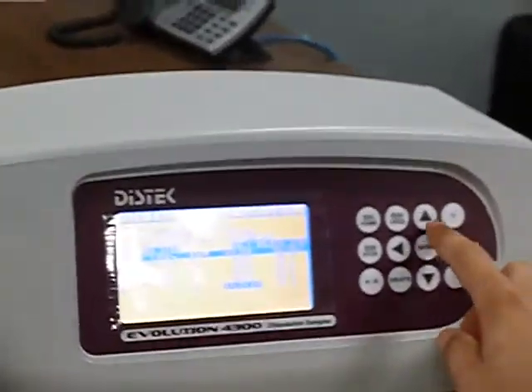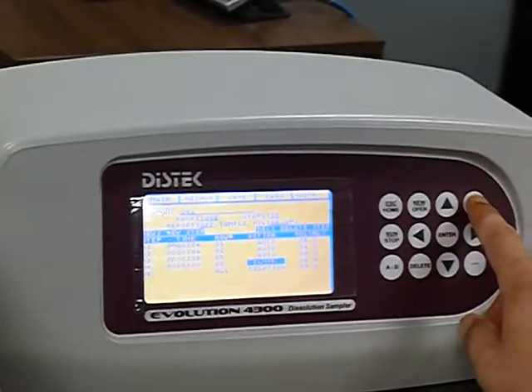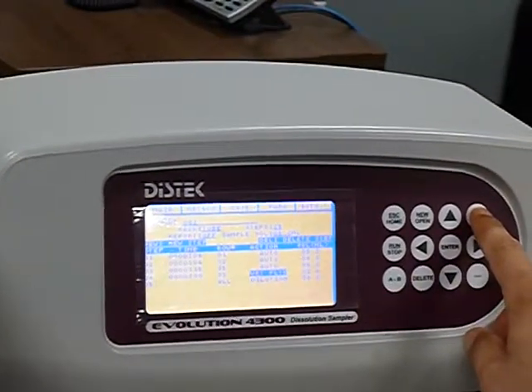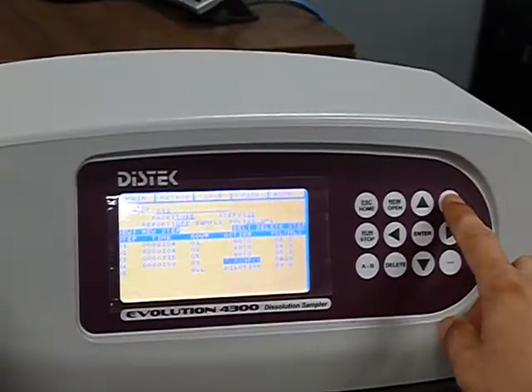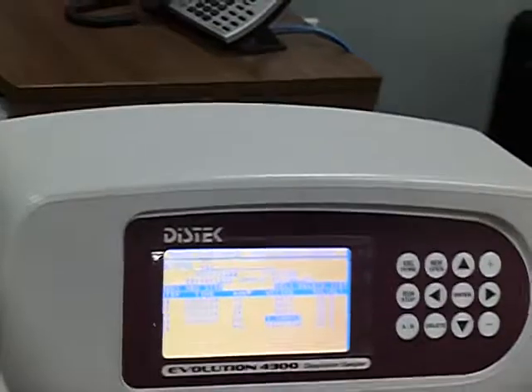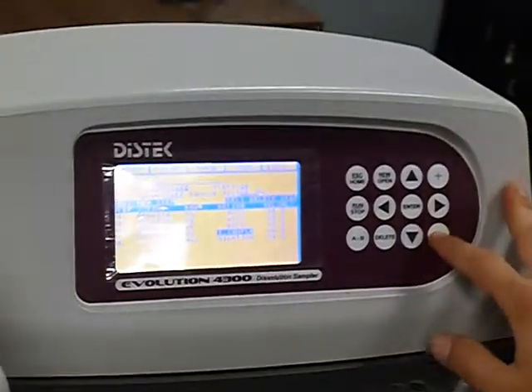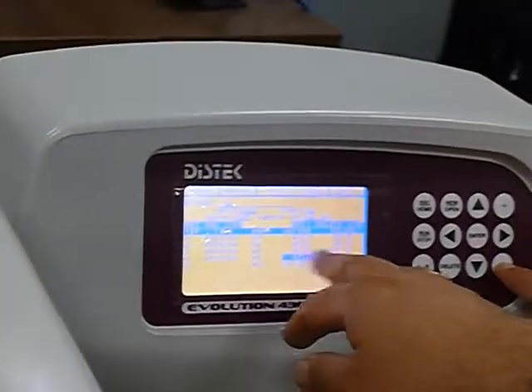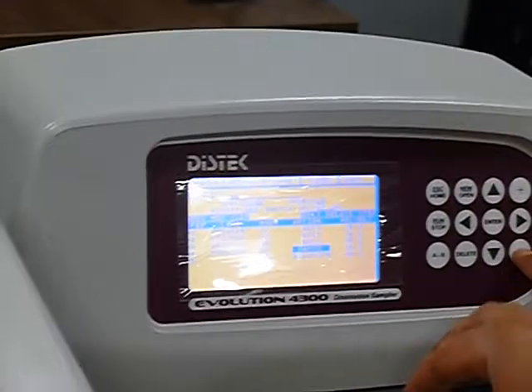Now, it says all, but you want to get yourself... I cannot select the dilution. Then delete this row. You need to delete this row. You should have done that one first.